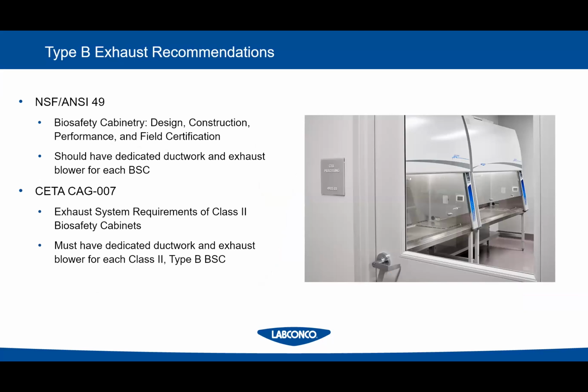These exhaust recommendations come from NSF ANSI Standard 49. That's the one that governs biosafety cabinets, and CETA as well. And I think ANSI Z9 also has some exhaust regulations specifically for how B2s are handled. So just be aware of those if you're looking for some guidance on what to do or how to make them work.